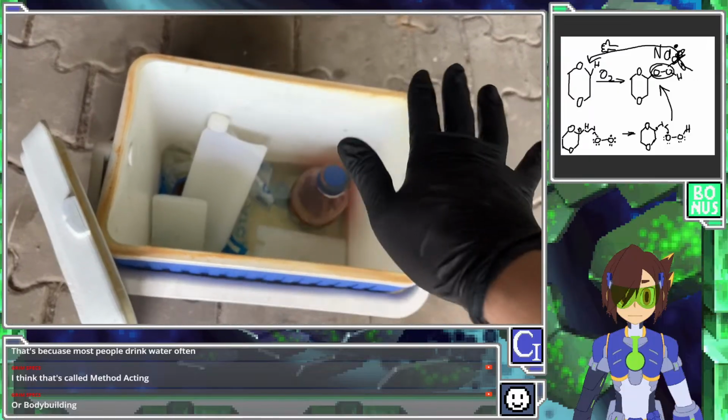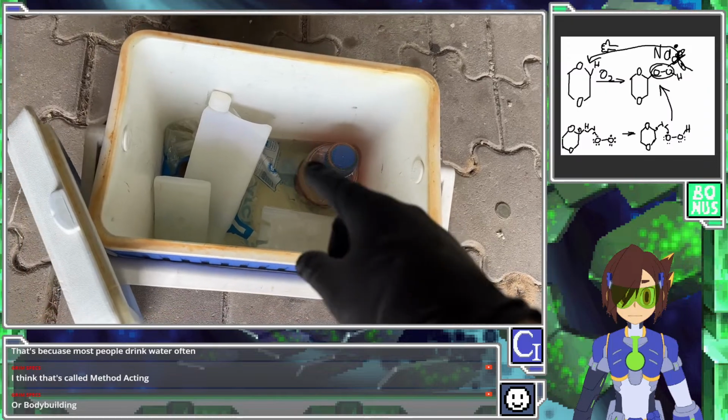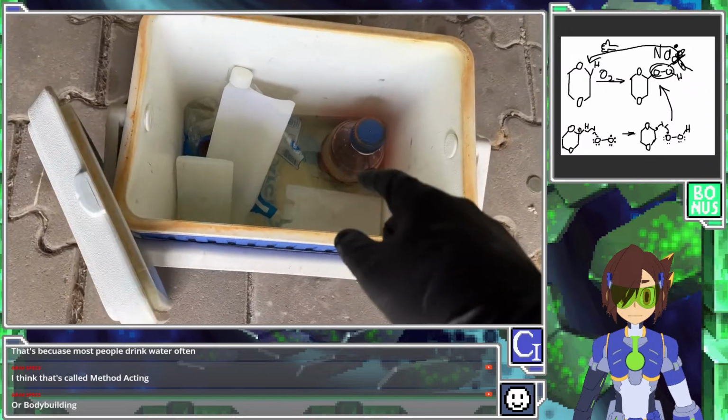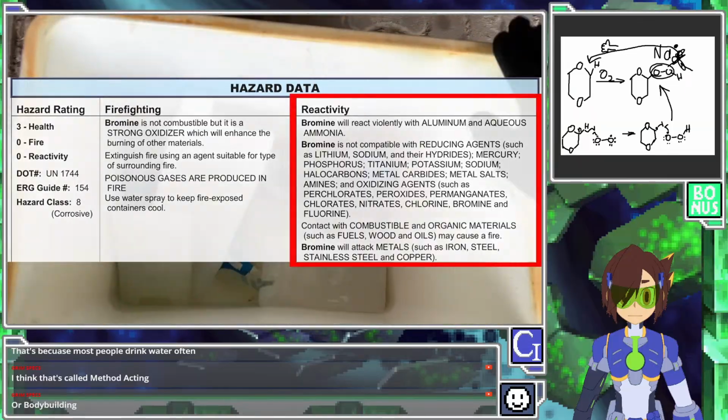Importantly, the timeline in this is roughly 4 weeks ago. A bunch of ice melted. And bromine is reasonably corrosive. In fact, extremely corrosive.